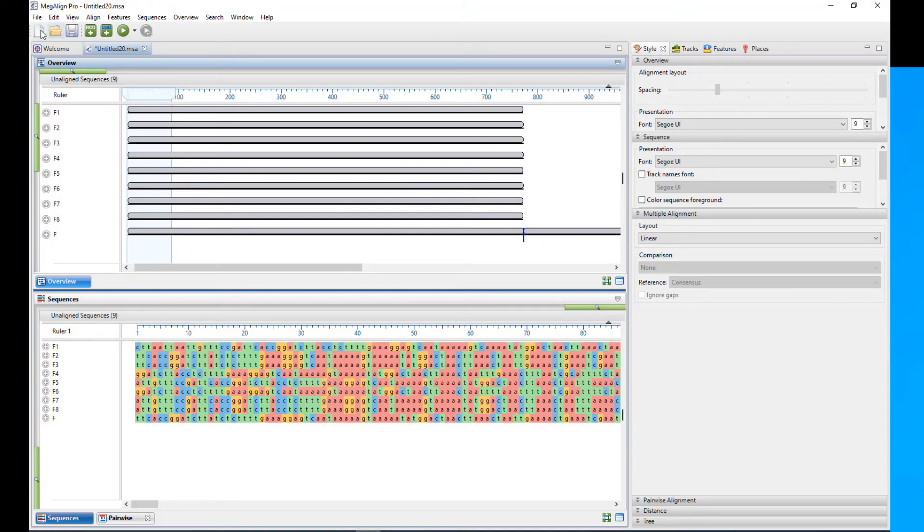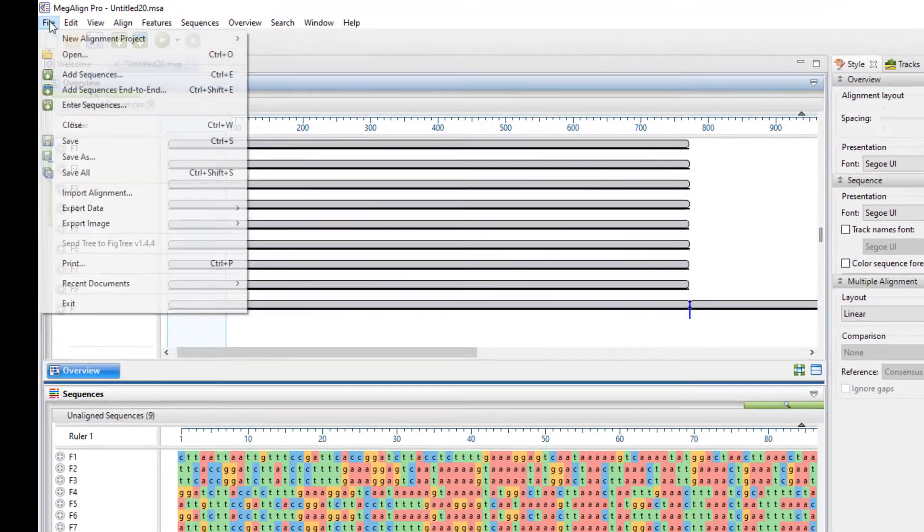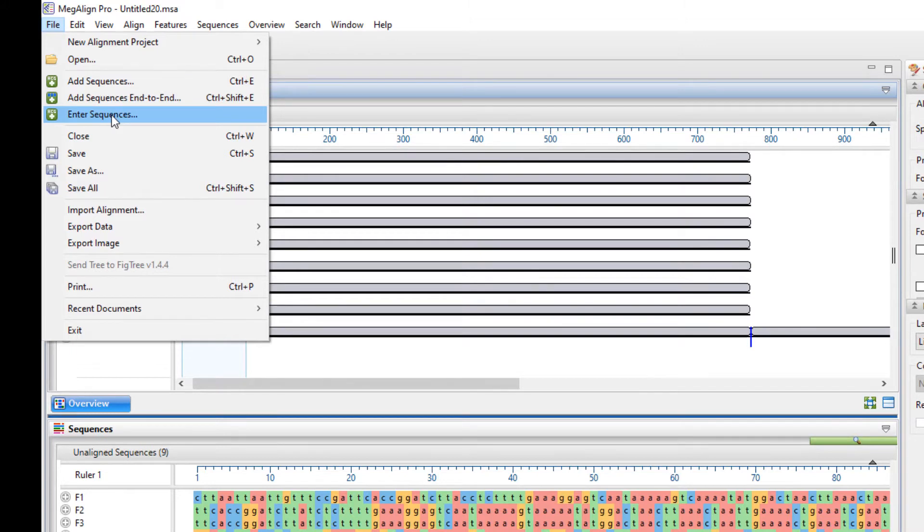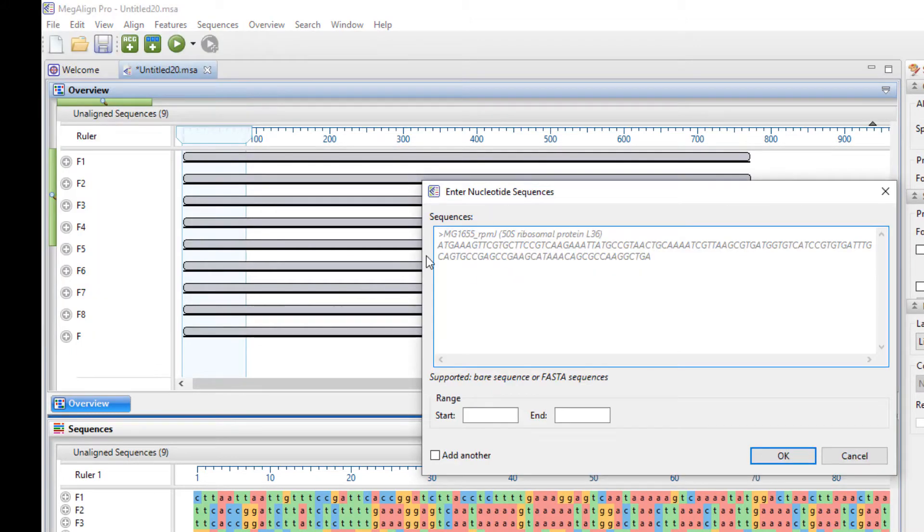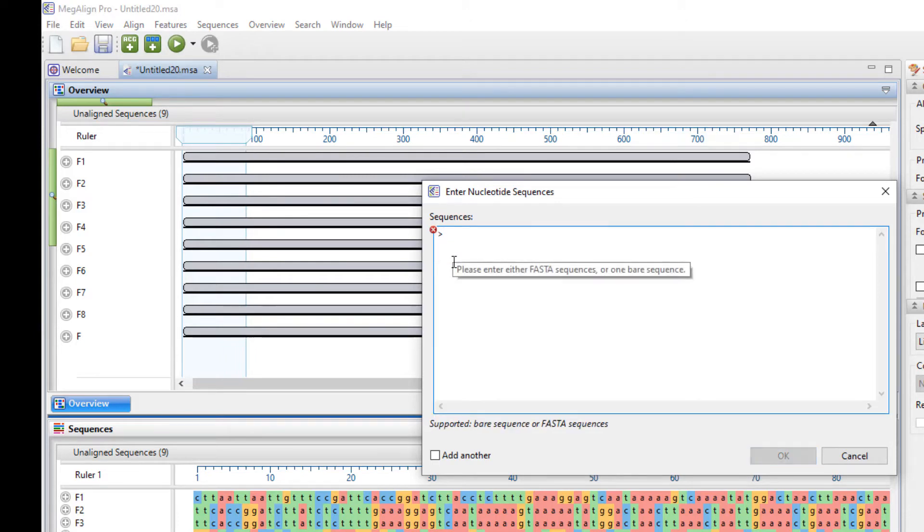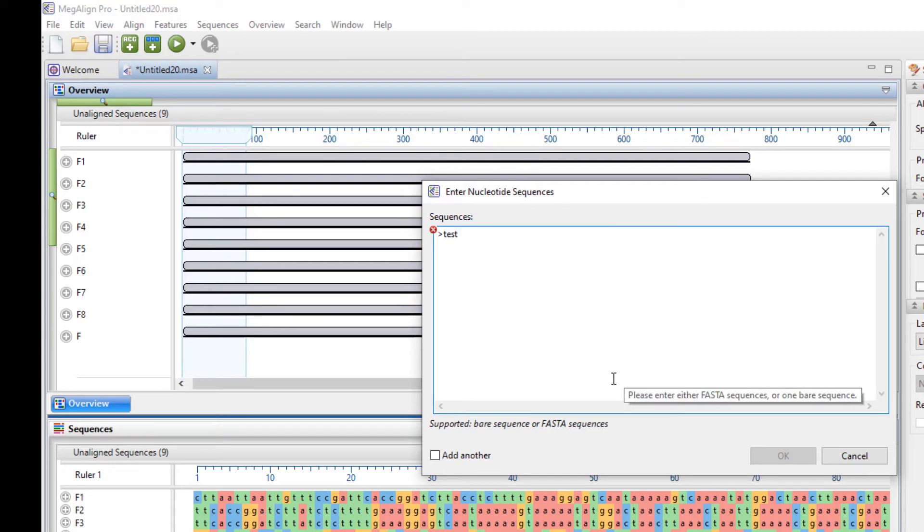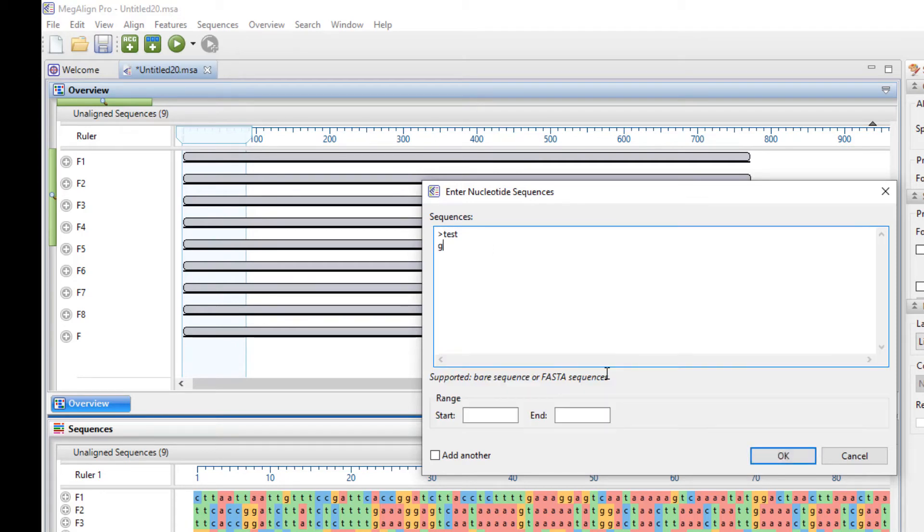And the very last thing I wanted to show you, bringing in samples for a new project, is to enter sequences. And this is more of a manual process. It's organized in a FASTA format. So you need this little caret at the beginning. You can enter your sequence name, and here you enter your sequence. This can be pasted in, or you can type it in manually.